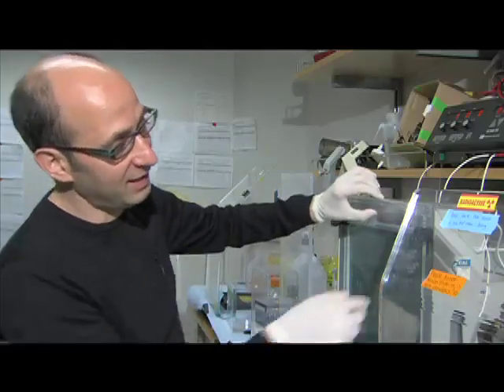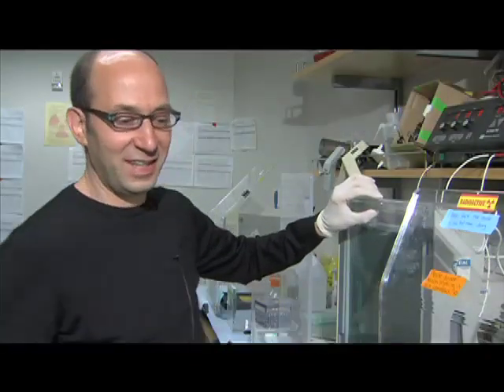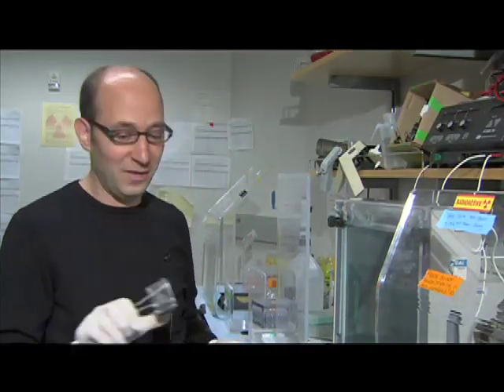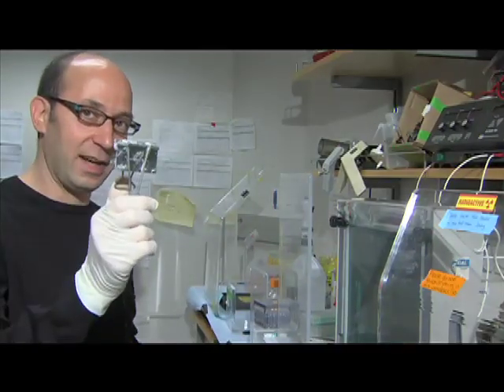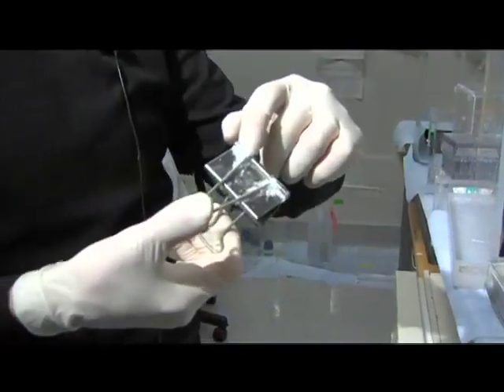And so it has this nice feature of a safety lock that when the electrode is in, you can't open it up. But basically, it's a fairly simple piece of technology. When you're pouring the gels, which I have to say is quite a bit of a pain and something I don't miss at all, use a high-tech apparatus called the paperclip to hold it together. And you notice there's a lot of urea here, and that's because you use urea to keep the DNA denatured. But essentially, it's a simple 1970s piece of technology, but it works.